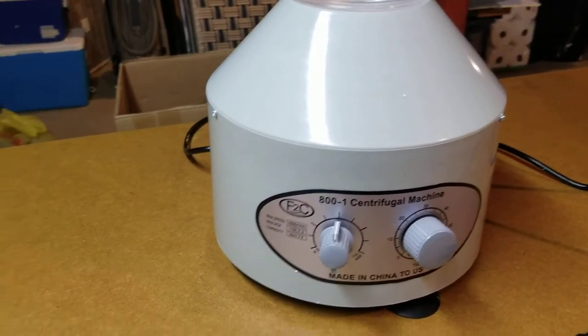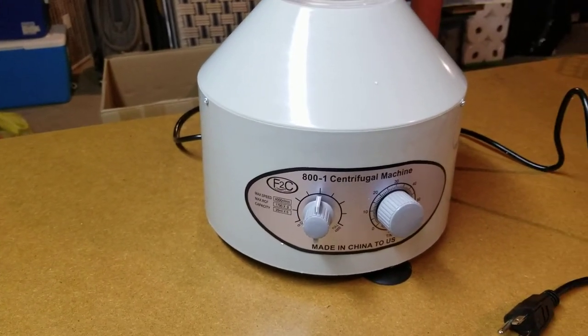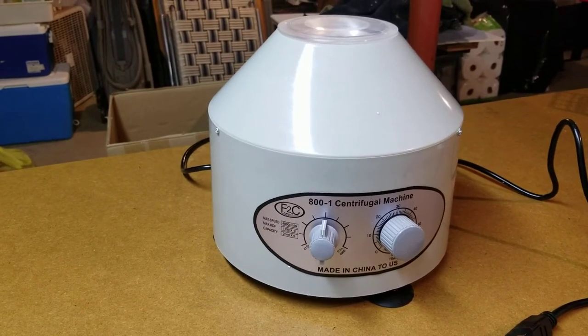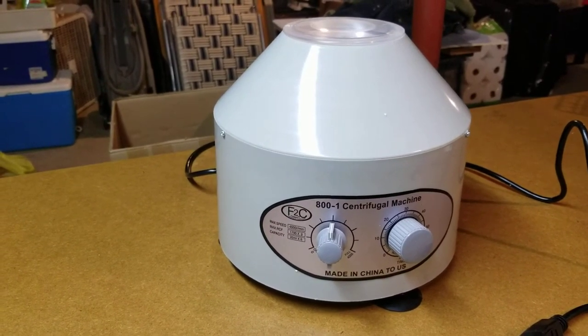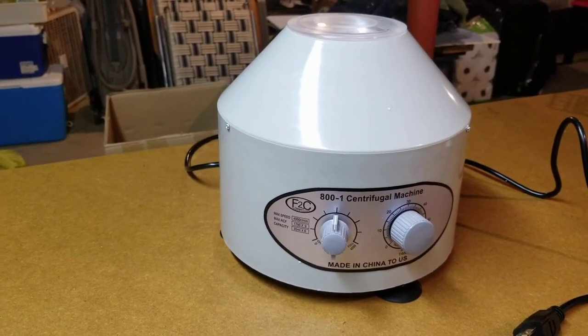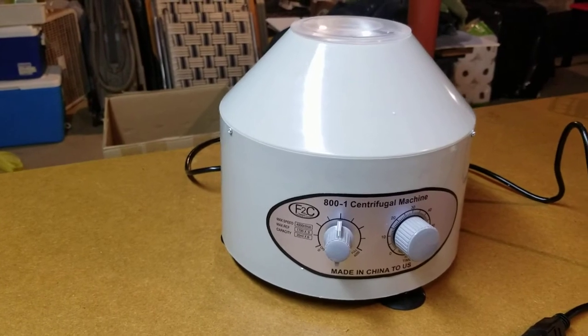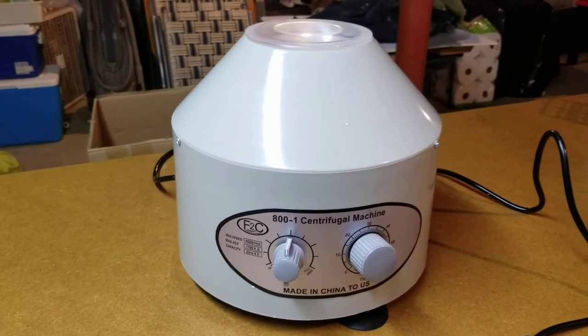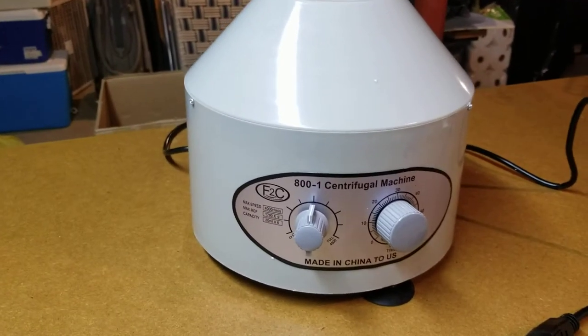Hi YouTubers. Today we're doing a review of the Superdeal Pro Desktop Electric Lab Laboratory Centrifuge Machine Lab Medical Practice with Timer and Speed Control. These Amazon titles are really long.